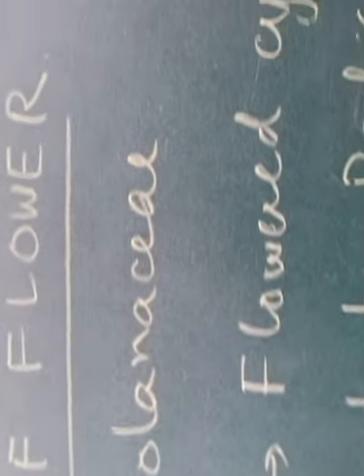The flowers that we are going to study here are brinjal and tomato. Brinjal is Solanum melongena, and in tomato the scientific name is Lycopersicum esculentum. You can see L. esculentum. I should have underlined it. It has to be underlined separately if you are writing by hand. Usually in books it is in italics. So when you write a scientific name, remember to underline it separately, or else the marks will be deducted for that.